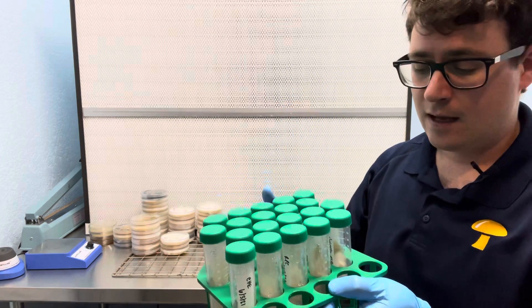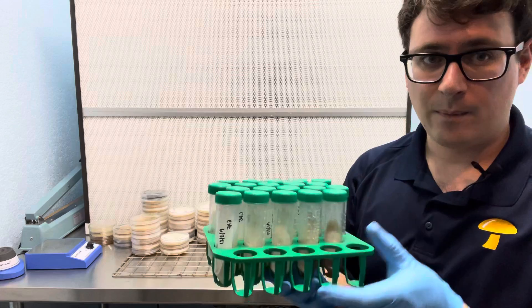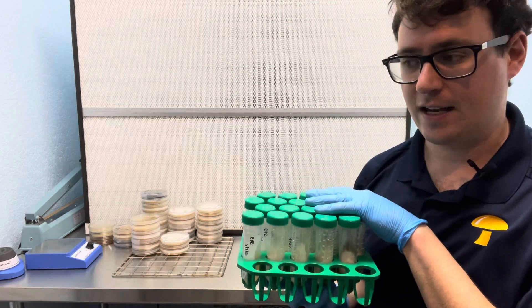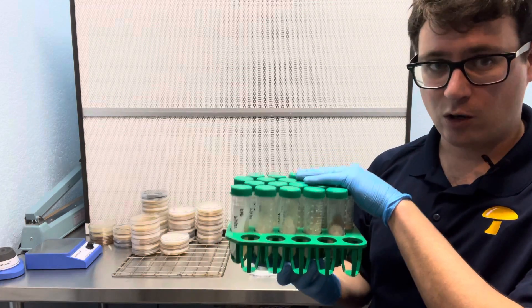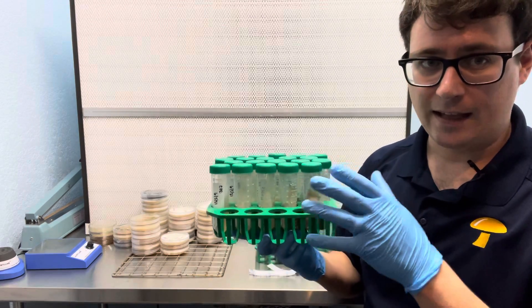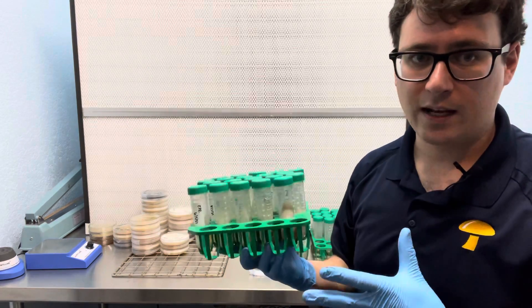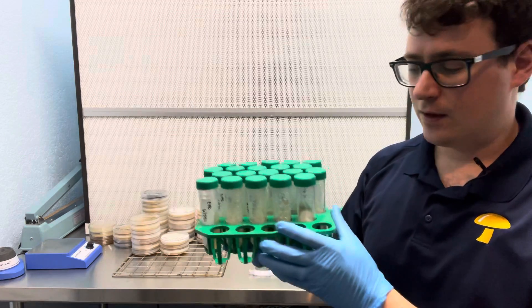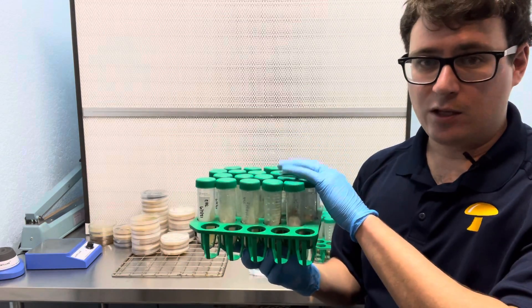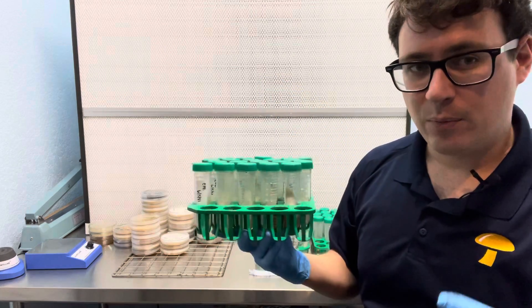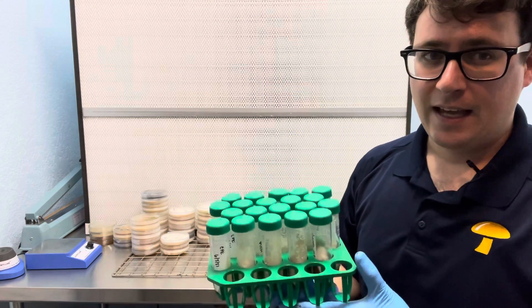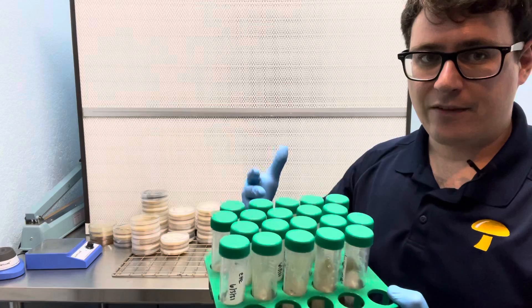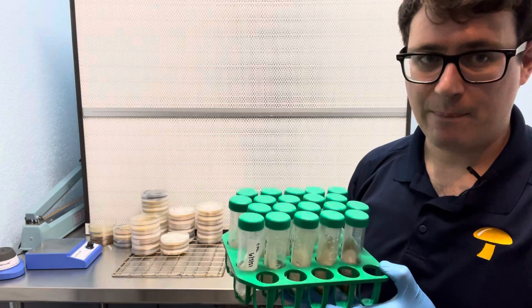You want to avoid freezing but if you are extra precautious and you're worried that some of your warmer strains might not last in cold storage you can keep them at the very entrance of your walk-in where it's about 50 degrees. I also keep a backup of these in my utility closet that pretty much stays in the 50s and I feel like it helps to have extra backups in case something did happen.